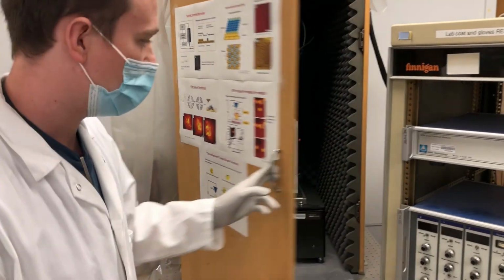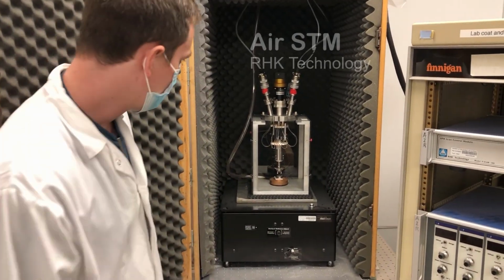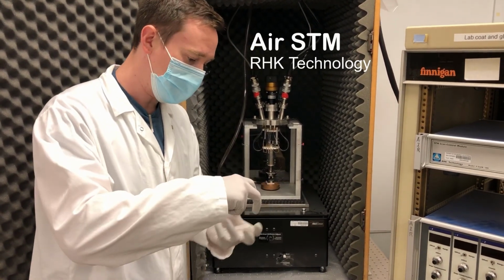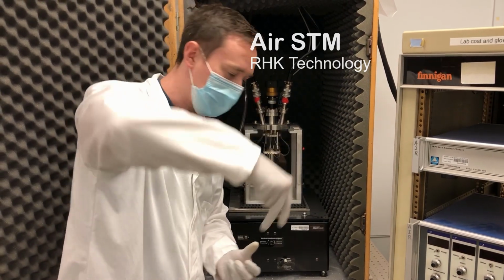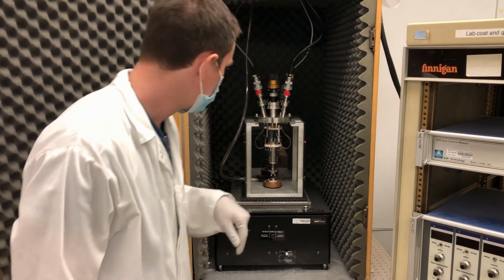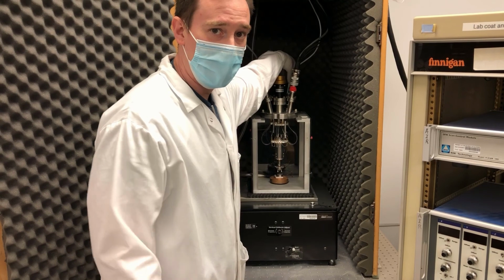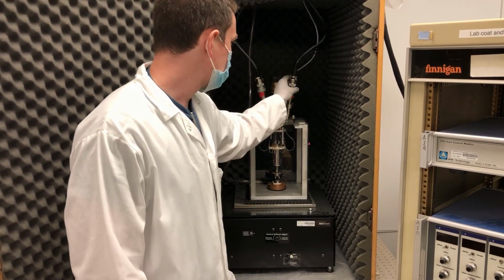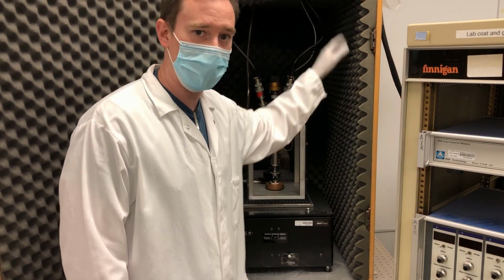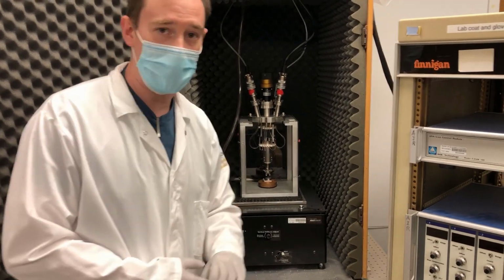So here is one type of scanning tunneling microscope that can be operated in air or in liquid. And so you can see here, we have all these wires here that go to tubes that will walk down a ramp. And in the middle, there's a tip that can then approach the surface. Okay? And then again, we have this transimpedance amplifier here to measure the current signal. So although this is really nice, we need to have a nice vibration isolation and acoustic isolation because these are really, really sensitive measurements. This can also be done in ultra-high vacuum.